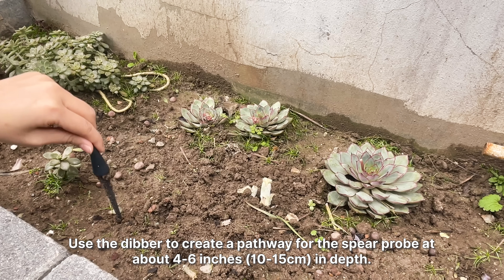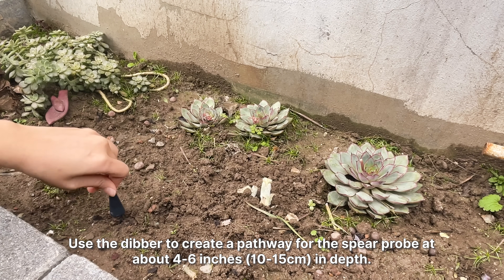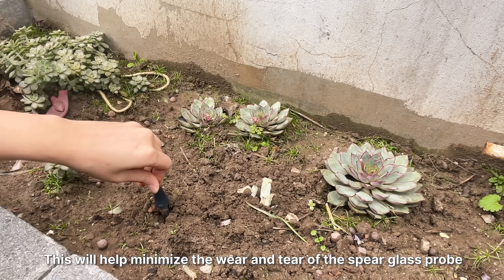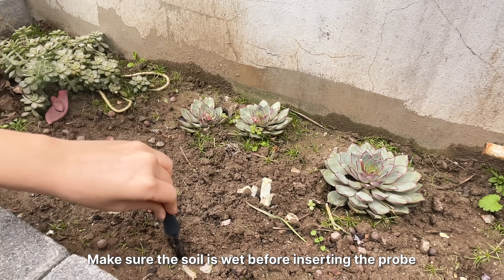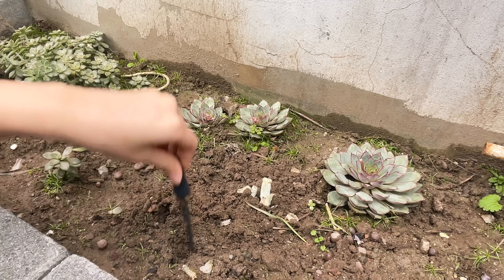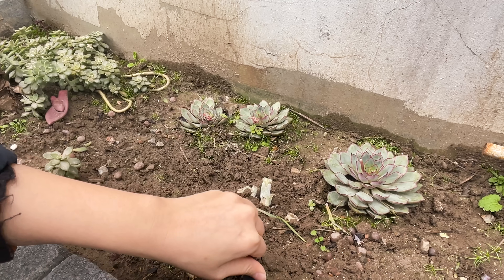Use the dibber to create a pathway for the spear probe at about four to six inches in depth. This will help minimize the wear and tear of the spear glass probe. Make sure the soil is wet before inserting the probe. If it's dried out, add in some distilled water to moisturize the soil.